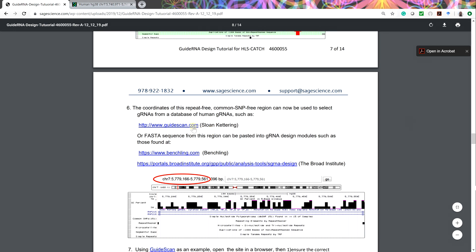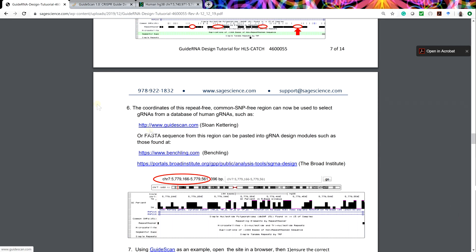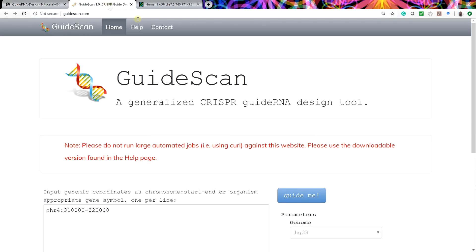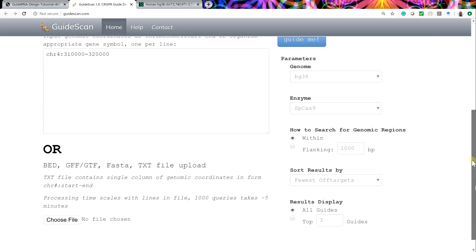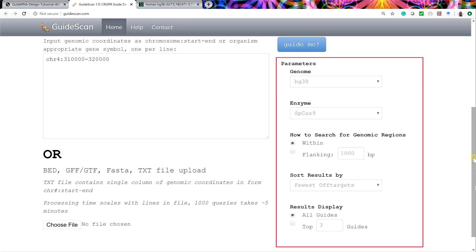Before starting, it is useful to have guidescan.com open in the browser, as guide RNAs are quickly generated and the process can be iterative. The link to Guidescan from Sloan Kettering and links to other useful guide RNA modules can be found in the PDF guide. When opening Guidescan, make sure the following parameters — likely the default settings — are selected.